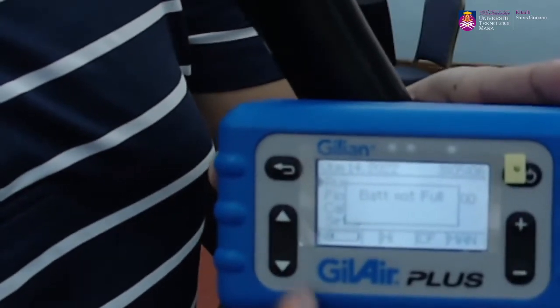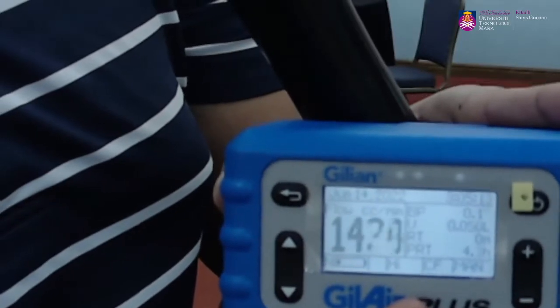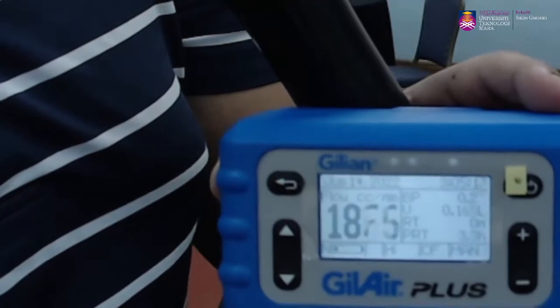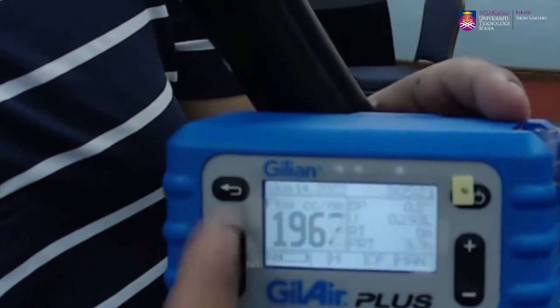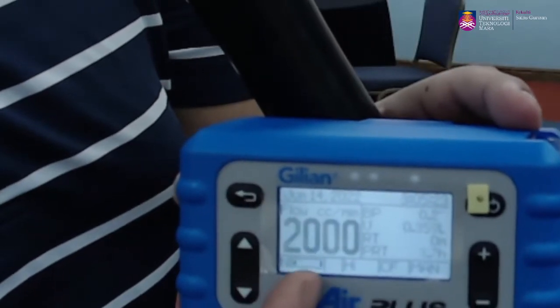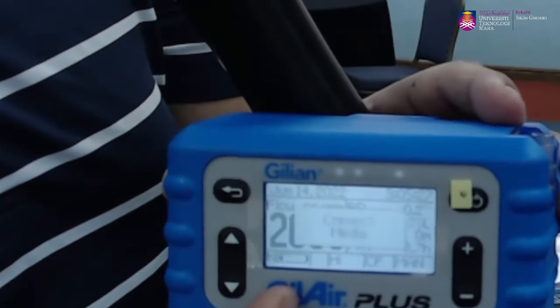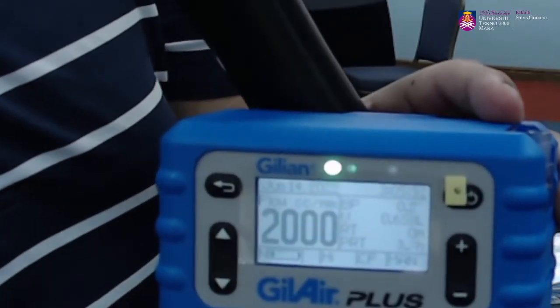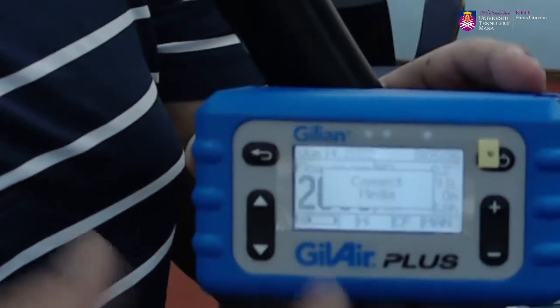Okay, so dia akan bagi tahu kita indicator a few things in terms of battery low and then in terms of kita punya connected media ataupun tak. Okay, so daripada sini kita tak connectkan kepada apa-apa media, it's just kita dah startkan run. Okay, so dia akan take a few seconds untuk dia reachkan 2000 cc per minute. Once dia dah reach 2000 cc per minute and stabilize, dia akan keluar blinking green, dia punya LED.